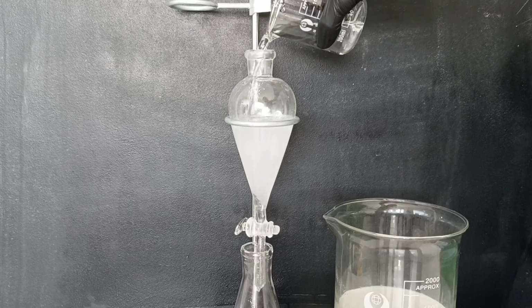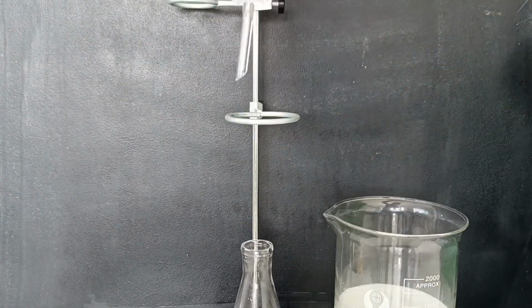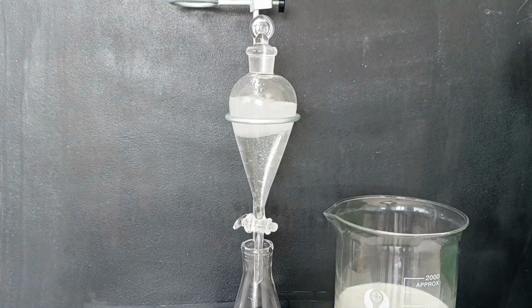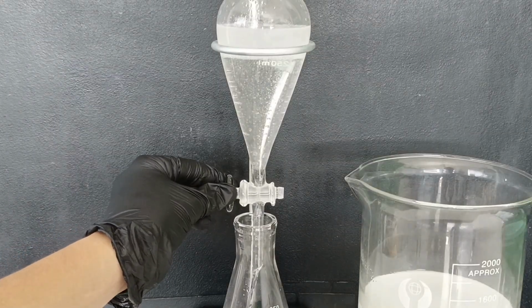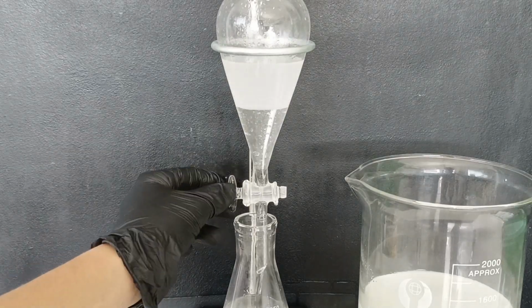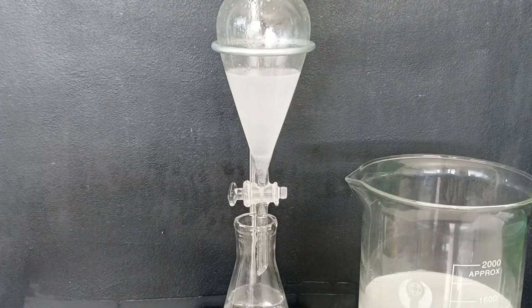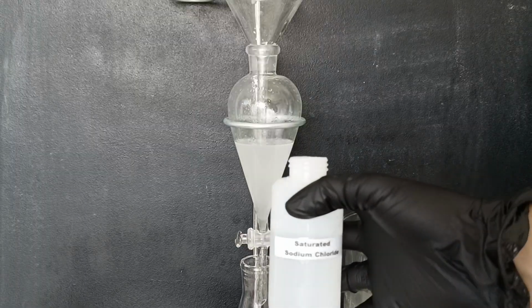The same process was repeated again with more water. This further cleans out the toluene from any MIBK or butoxyethanol that was in there. As you can see, our organic mixture is still very cloudy because it's quite wet.